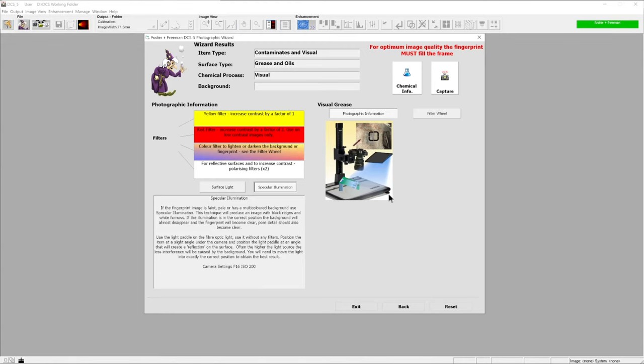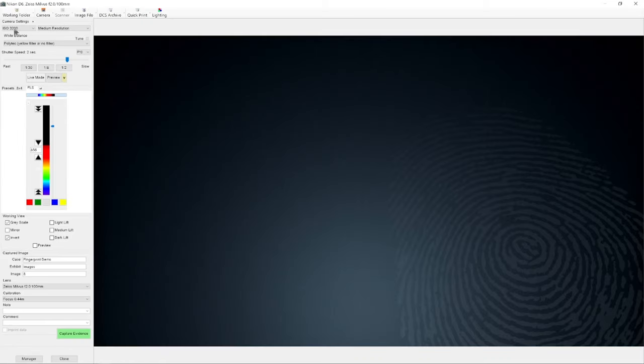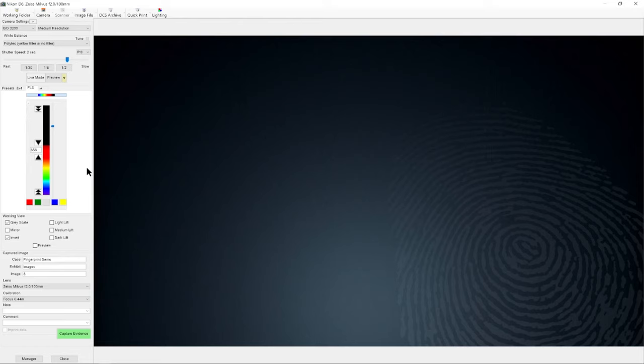Once we have read this outline, what we can do is press capture to come straight through to the capture screen and begin the capturing process. Actually, what we could do is, whilst the wizard is open, set up all of the lighting and then just press capture to come through to the capture screen.